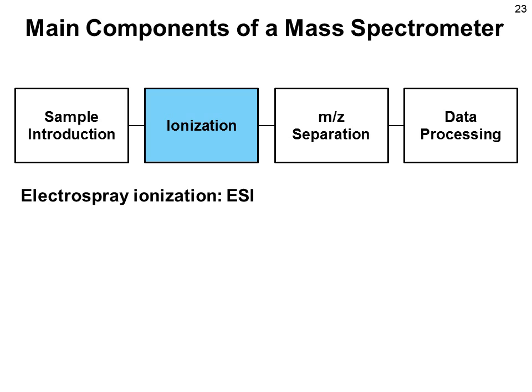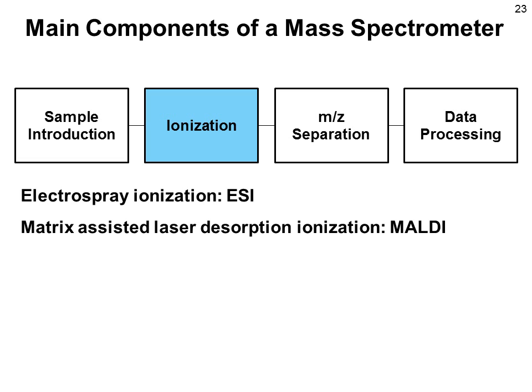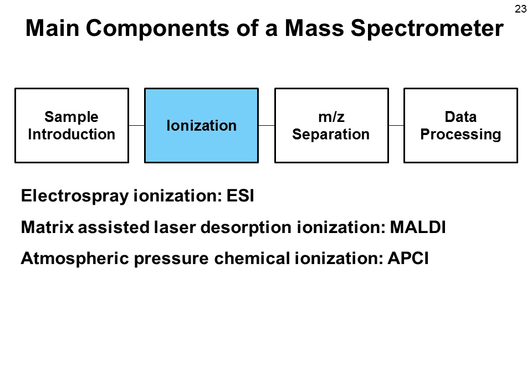We've discussed electrospray ionization, ESI, as a soft ionization technique to transport molecules from the liquid into the gas phase. Now we're going to look at 2 other important ionization techniques. First of all, matrix-assisted laser desorption ionization, also called MALDI. This ionization technique transfers ions from the solid state into the gas state under the impact of a laser. Finally, we'll take a brief look at atmospheric pressure chemical ionization, APCI, which is useful for molecules that do not contain ionizable groups.